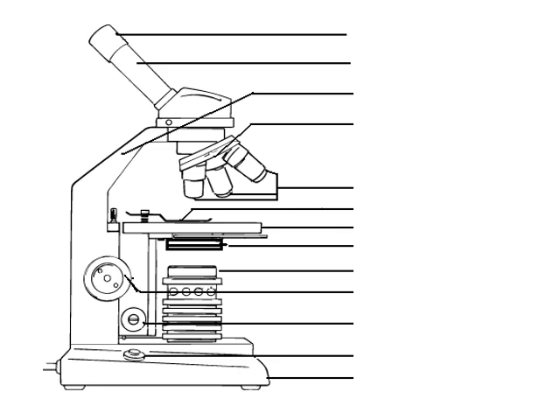The first part of the microscope is this lens that's up at the top here. When we first look through, we've got a lens that's up here. This is the ocular, or we can call it the eyepiece. And a lot of times on your microscopes, when we get them in the classroom, you'll see that it says 10x on it. So this tells you that it magnifies whatever you're looking at 10 times bigger than real life, or what the naked eye can see. This is the body tube. So in here, the image is going to travel down here. It's going to be flipped around with some mirrors, but this is the body tube.